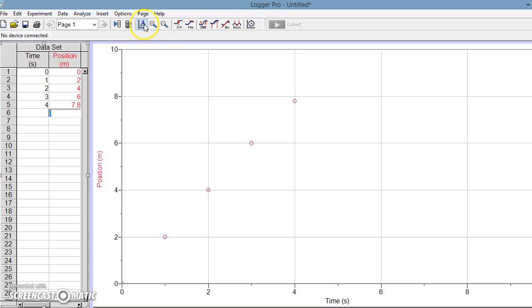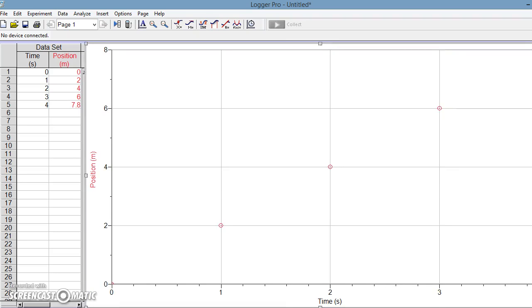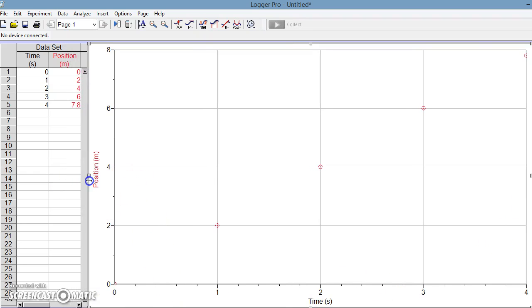Now if we hit this button here, this button will be your friend. It's called the auto scale. Okay, when I click on auto scale, I can see that the points are trending upward in a pretty consistent pattern. Now in fact, at the moment, you can't even see the 1 point because the graph was a little bit bigger than my screencasting video was. So I'm just going to move these over just a little bit to fit a little bit better.